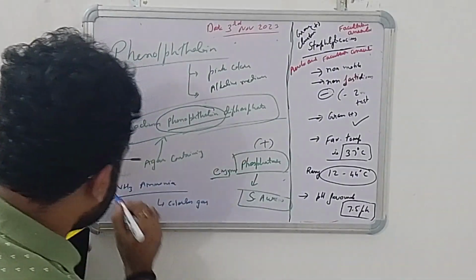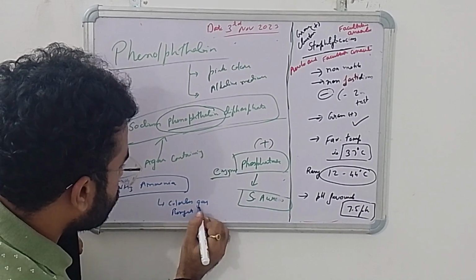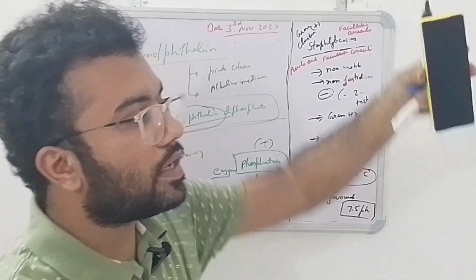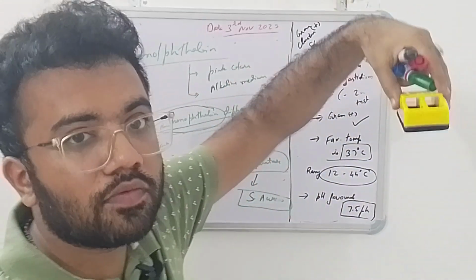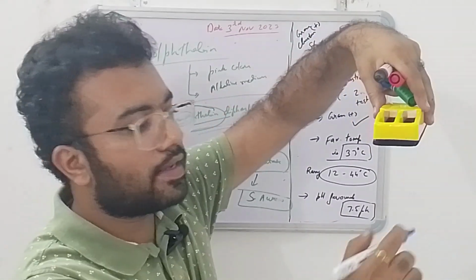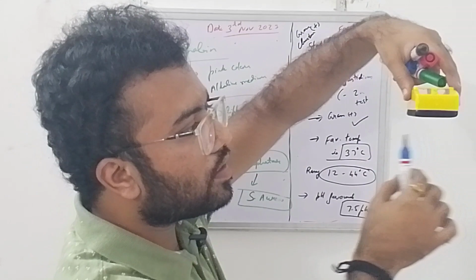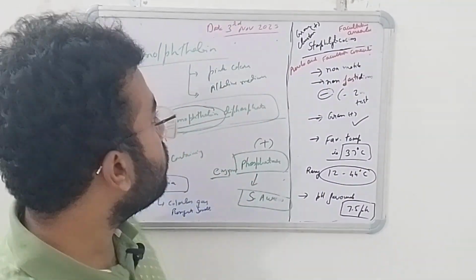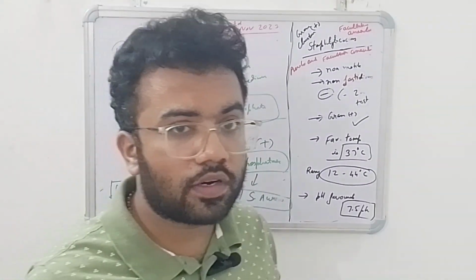So when we open the upper lid and place the plate inverted over this colorless gas NH3, what will occur is that it gives a pink color, because we know that phenolphthalein gives a pink color in an alkaline medium. The alkaline medium here is NH3.